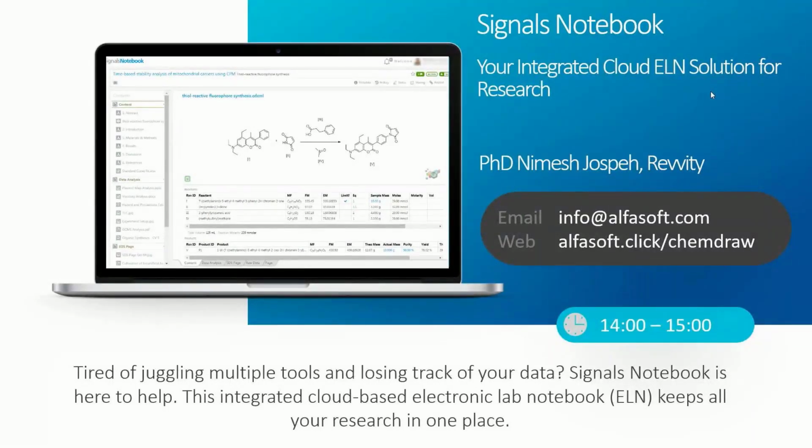So we have a dedicated application for CRO workflows, which we call Signals Synergy. And this was launched pretty recently, in the last few months. What Signals Synergy enables you to do is to seamlessly integrate with the Signals Notebook and the wider Signals Research Suite to offer a secure slice of your tenant for interacting with each CRO through a collaboration portal.